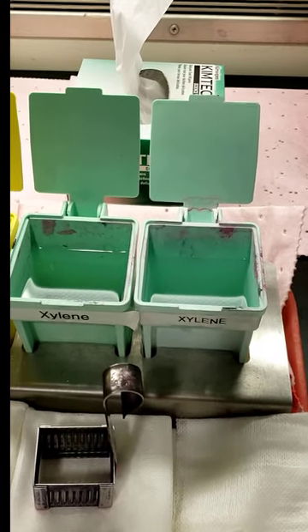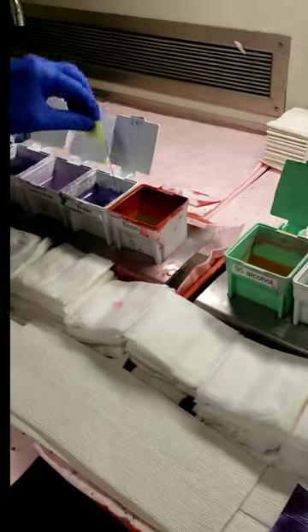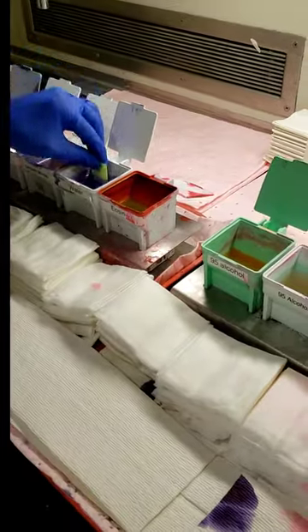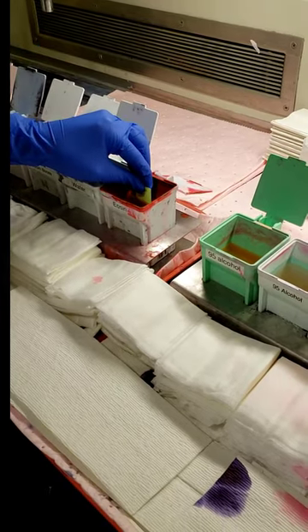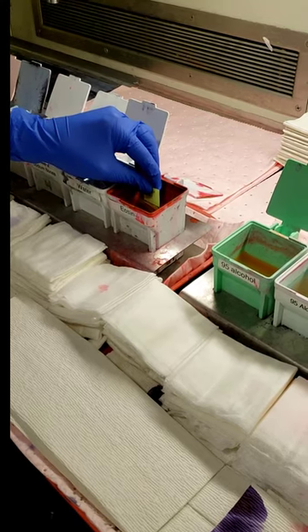Eventually we'll get this fabulous slide all stained up. It is then going to be cover slipped and go to the pathologist for the frozen section diagnosis.